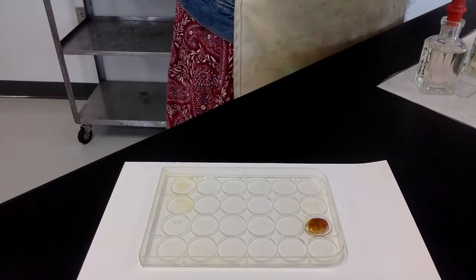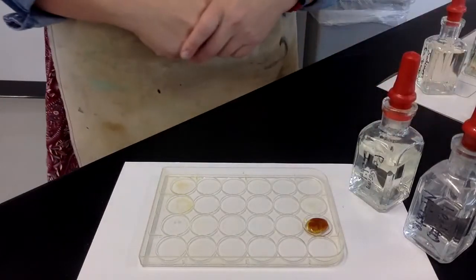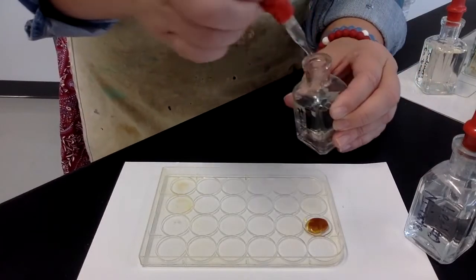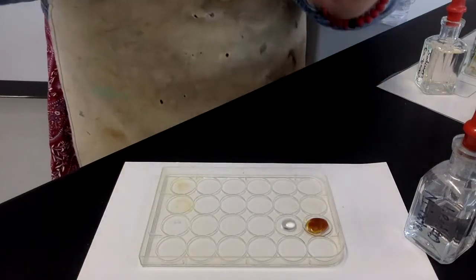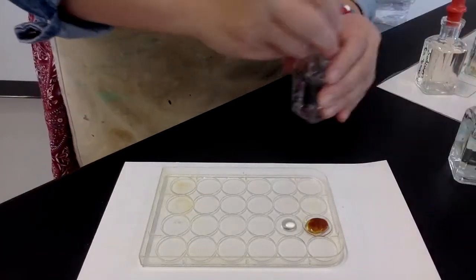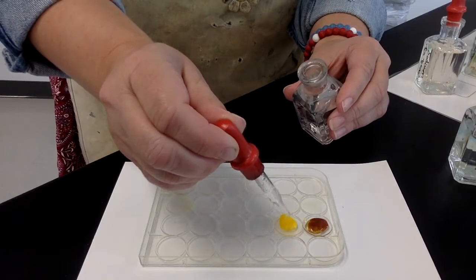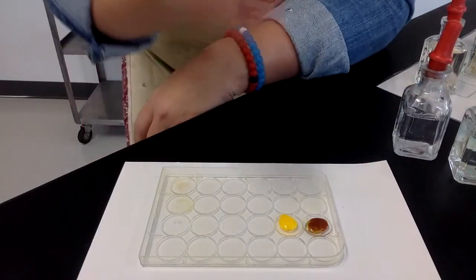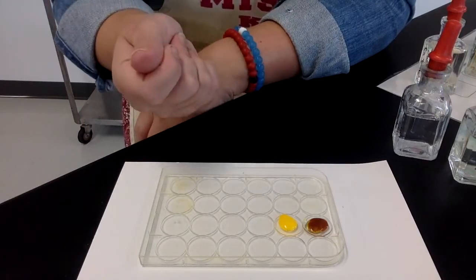Reaction number 2 needs lead 2 nitrate and potassium iodide. All right, I'm going to do the same thing, 2 to 3 drops. So I'm going to put this one right next to it. So there's my 2 to 3 drops of, this happens to be potassium iodide. So there's 2 of your ions, potassium and iodine. And here is my other one. Check it out. Look at it. Okay, so definitely, again, a precipitate, chemical change, new identity that looks thicker, and this bright yellow color.